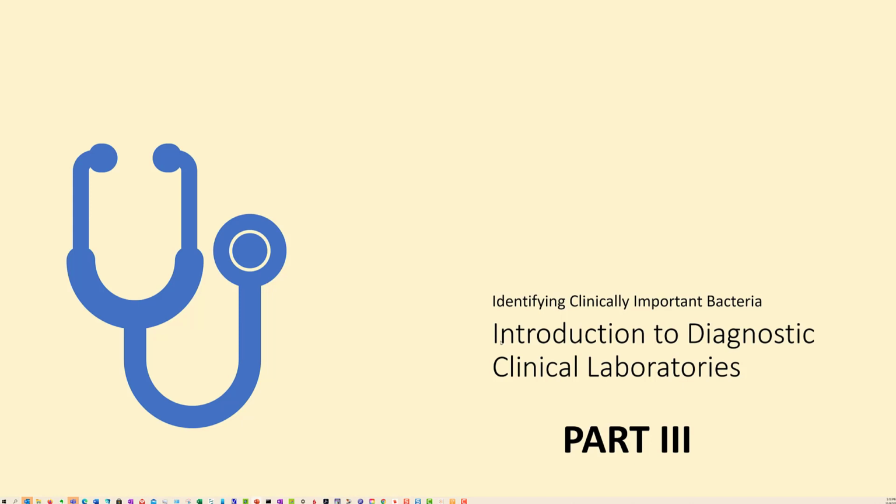So I'm going to stop there. That should give you enough. These are sort of technique reviews. You should have been already familiar with most of these, but again, it's really important in a clinical lab that we're aware of these techniques, we build on these techniques, and we're always conscious of the sterile field that's around us.